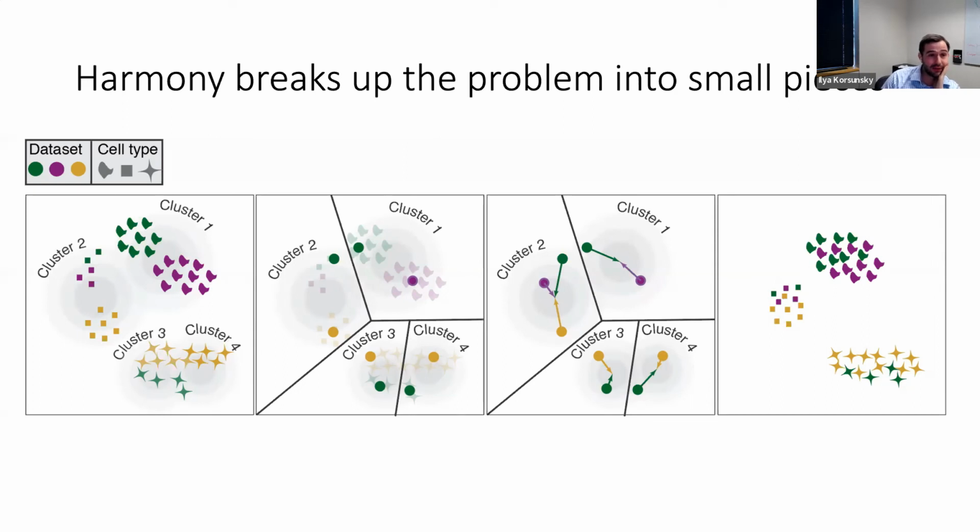I mean, the first thing I would do is plot it, right? Plot it and see how they separate. We found that sequencing batches don't really create batch effects in our data sets. Running things in different 10x lanes, running things on different days, I guess it's running things in different 10x lanes that creates batch effect. We found that sequencing in different lanes is not as much, right? But as a general answer to your question, plot it, color it by your variables, and it'll become obvious to you what the biggest source of batch effect is. Yes, so visualization is important here. Very much so. You can't rely on statistics alone.